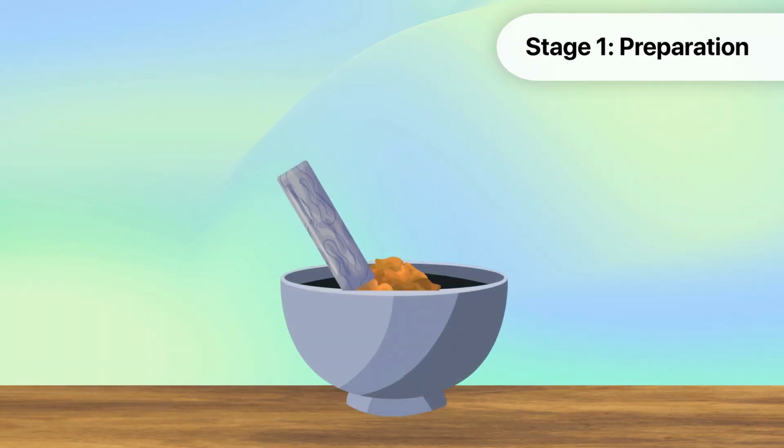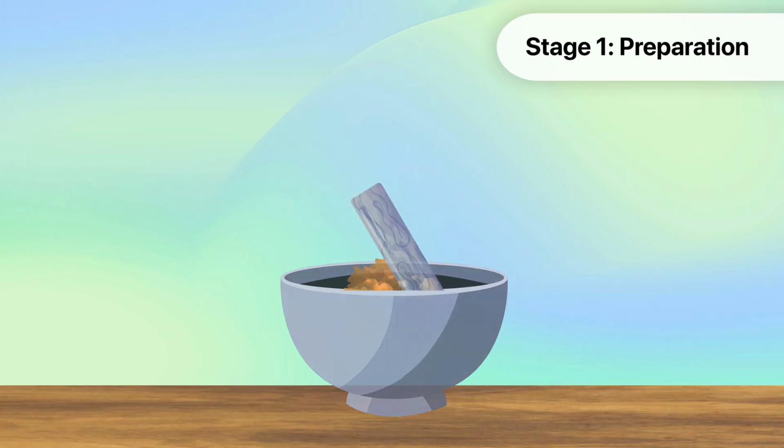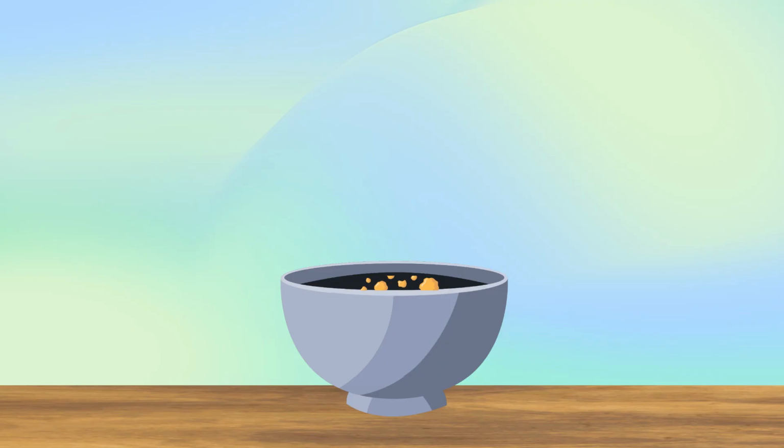For this practical, it's crucial to maintain a precise and clean setup to ensure reliable results. We'll walk through each test methodically, ensuring that our laboratory environment remains organized and tidy. We will begin by breaking up a small piece of the food sample selected using a pestle and mortar. We should now have smaller food pieces that can be used to make a solution.